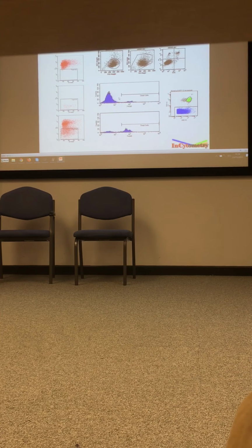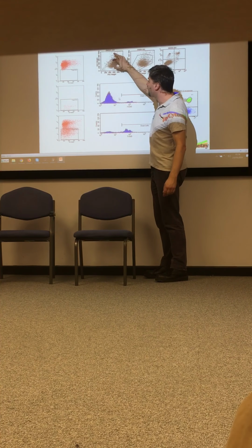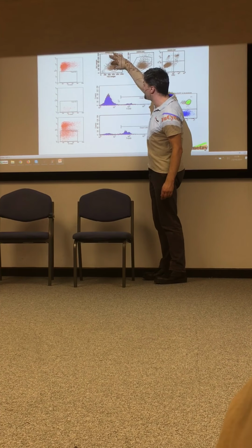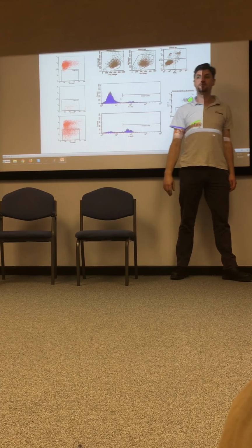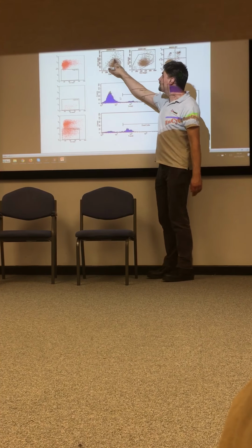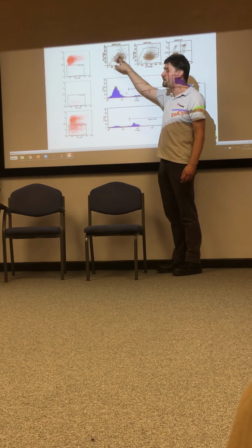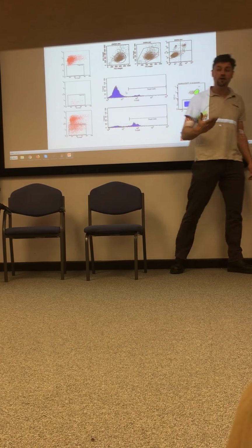So you need to put gates in a particular place because, again, this is my forward and side scatter. It's not going to make a great deal of difference to make that a bit bigger or a bit smaller. No real difference, to be honest. But you need to know that's what it is. So, if in doubt, gate on those ones and see what their profile is for fluorescence. Are they different to these ones? If they are, exclude them. If they're not, keep them.